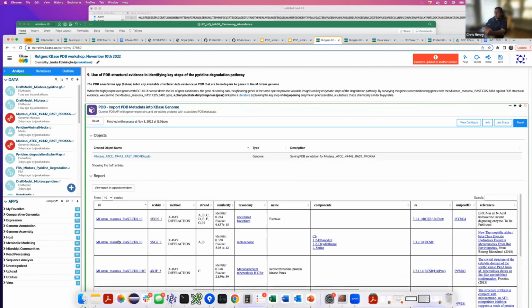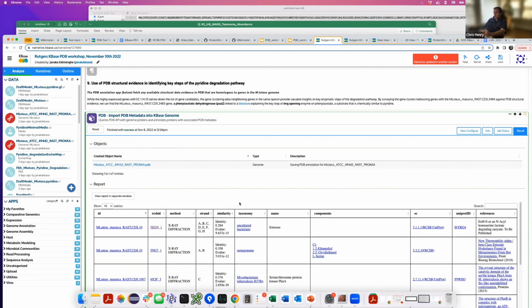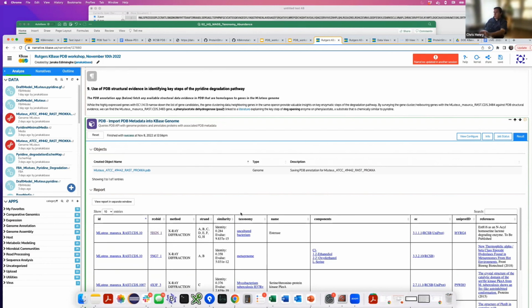And something we'll be thinking about for the future is, for example, can we inject the sequence of this gene into that sequence alignment that Shuchi was showing, so that you would actually see your gene show up in that as one of the sequences in that alignment. So literally you could go to this structure page and instantly see where the variation of your gene lands on this structure. So that's something we're going to be thinking about for the future.